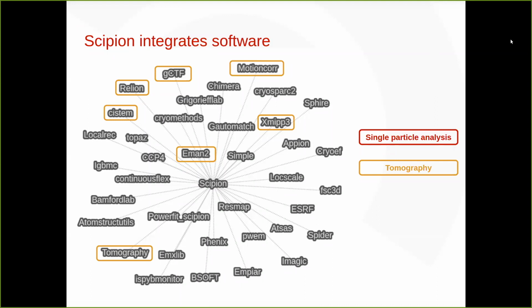If you see the tomography box down there, this is not 100% accurate, because it's in development. It doesn't reflect everything. That tomography box comprises IMOD, Dynamo, and some other plugins that I will talk about later. But it's wider than that simple box of tomography.